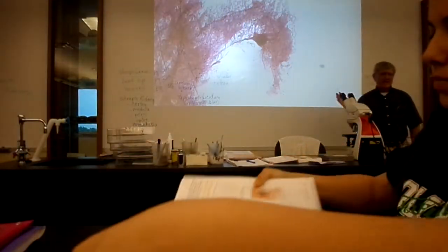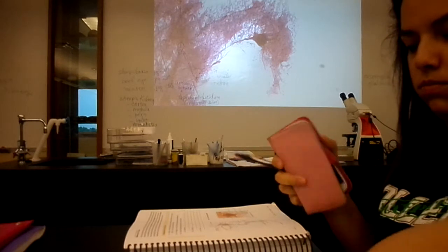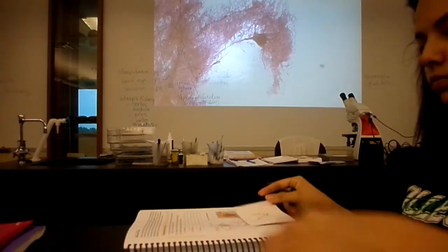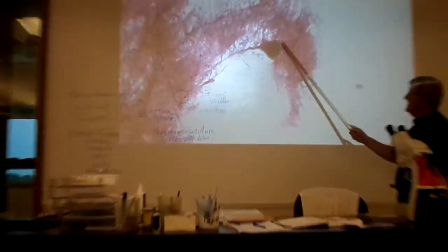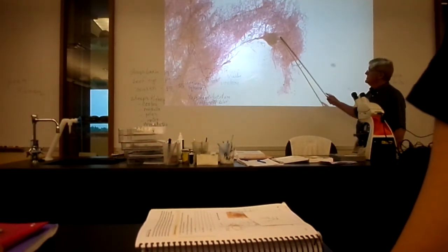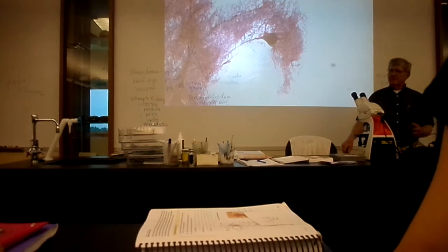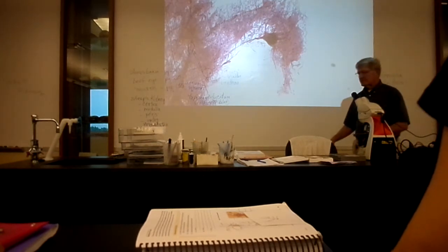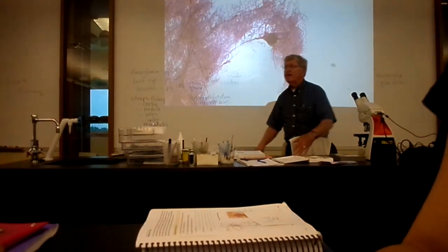Okay, this is as clear as I can get this projected image. I hope you're looking at your slide because you'll find that it is much clearer than this projected image. And I'm asking you to focus on a single cell called a neuron, like this one right here. And I encourage you to label the parts on page 155 on that photograph. Just like any other cell, the largest area of the cytoplasm and its enclosed nucleus is called the cell body. So on that photograph, the cell body would be structure number 3 that they have pointed to but have not labeled.